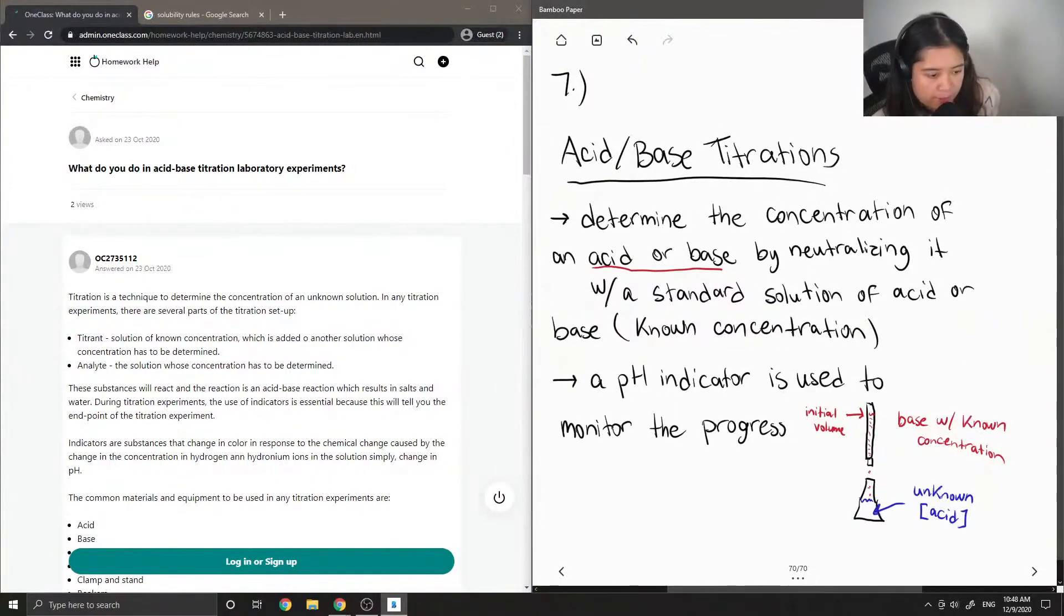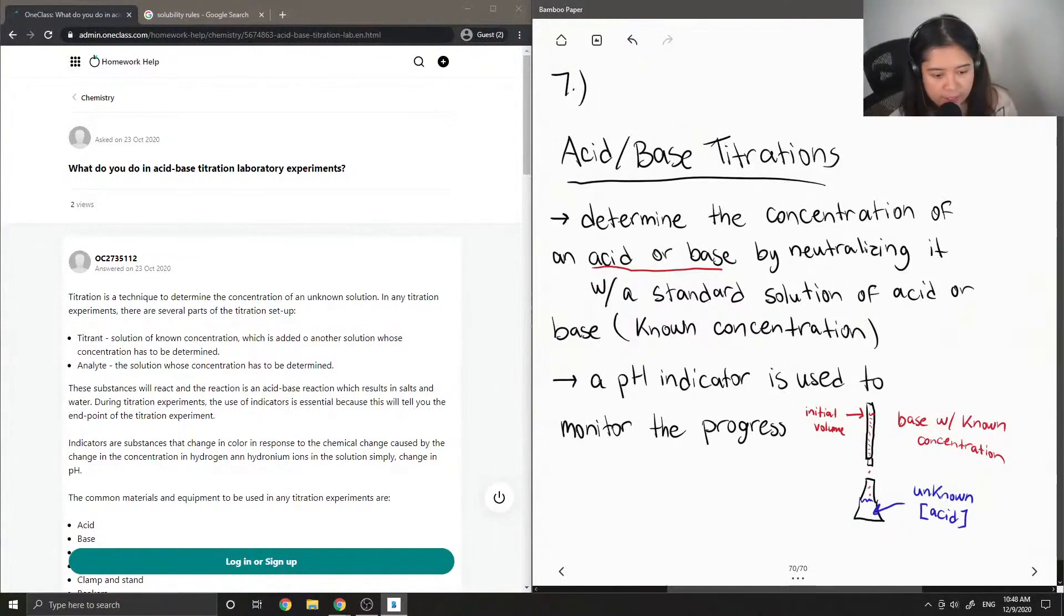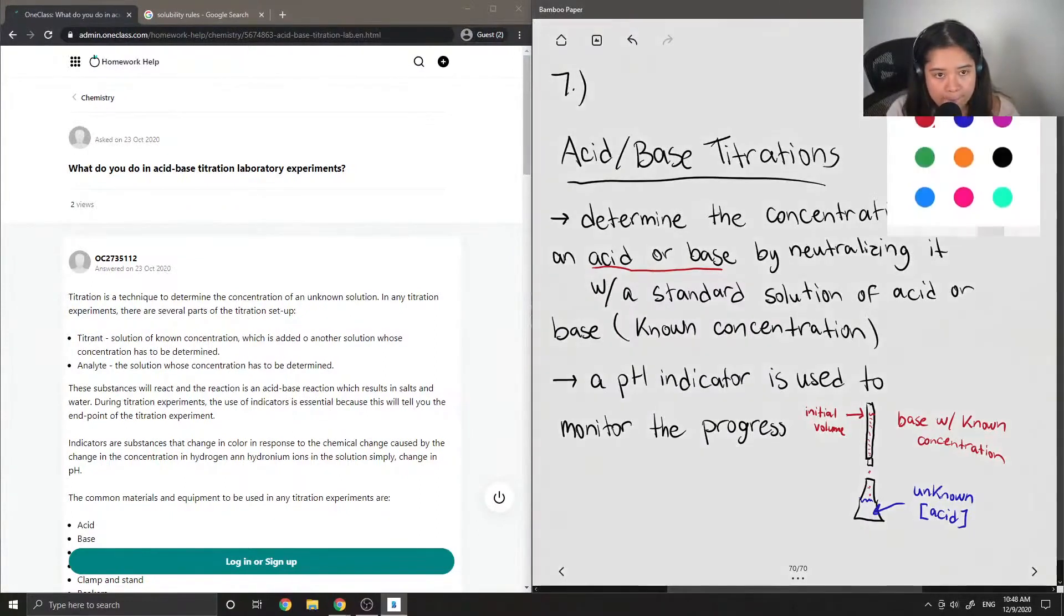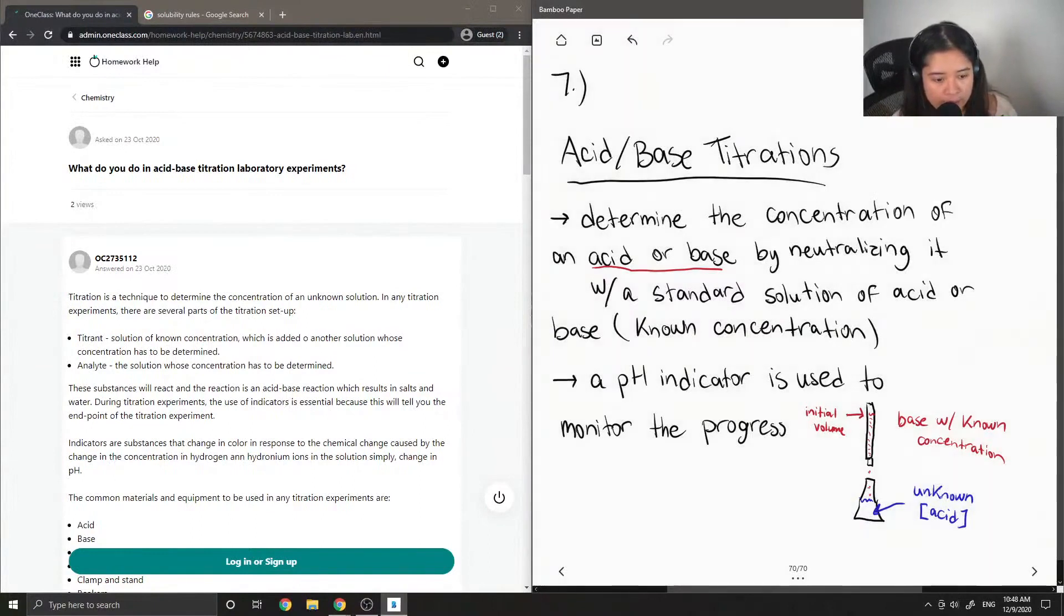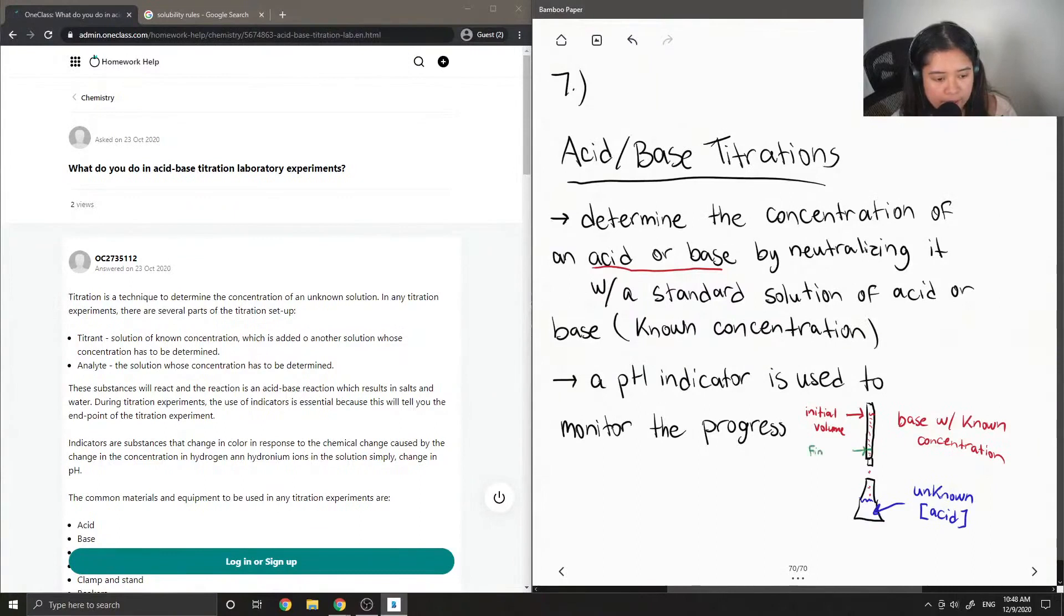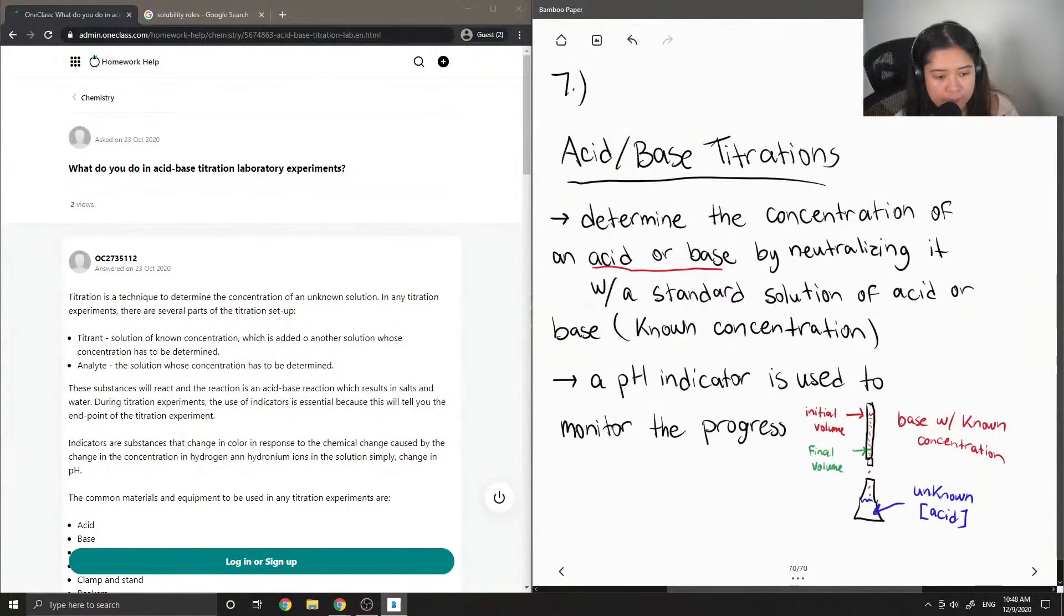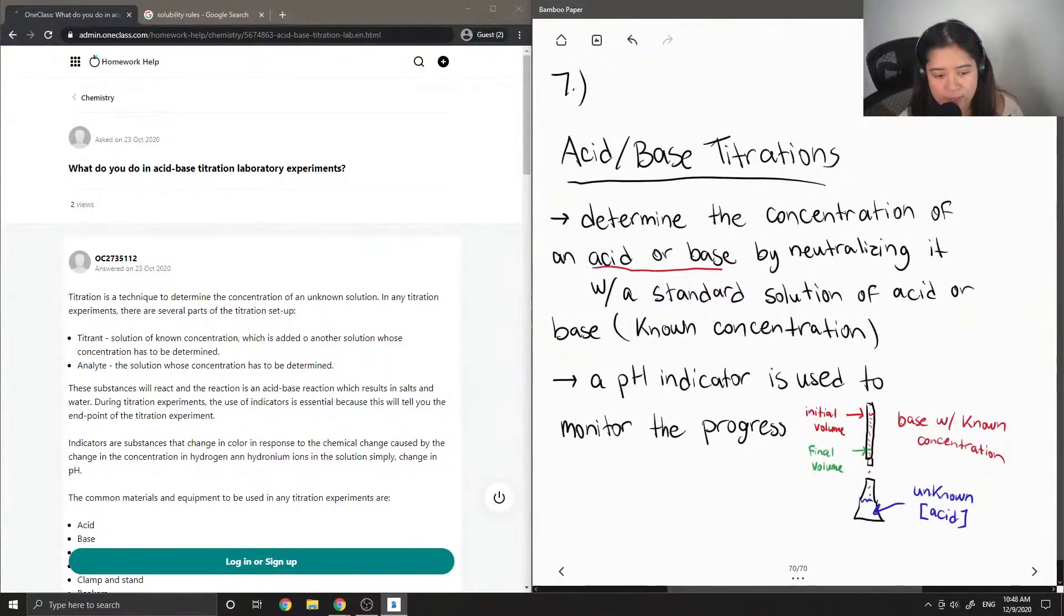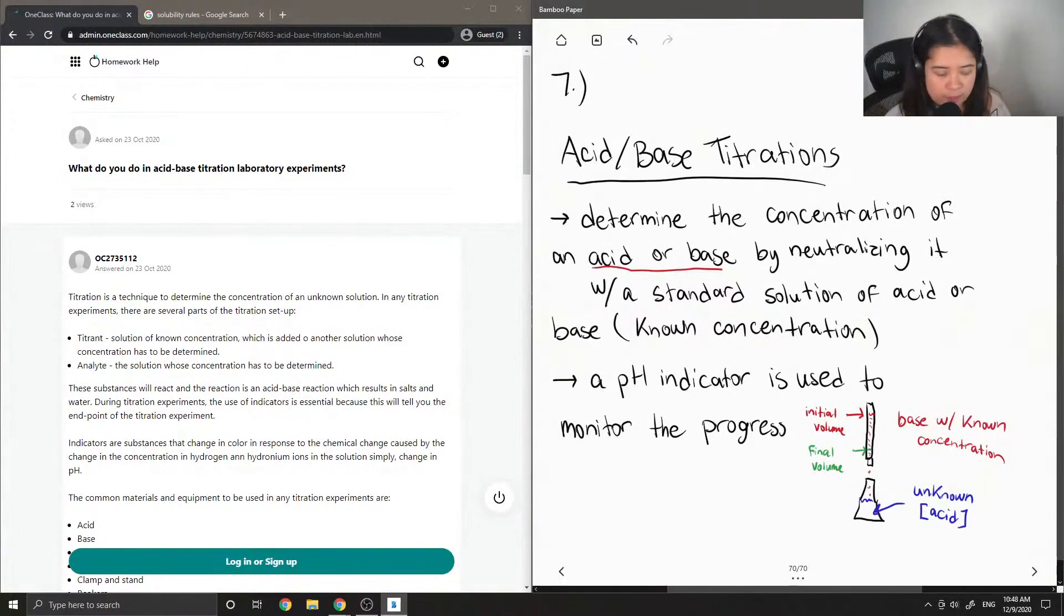When we get a light pink solution, then we know that we can stop the reaction, so we can stop adding more base. Then we want to end up finding out the final volume of base in the burette, so we know exactly how much base was added to the acid in order for it to be neutralized.